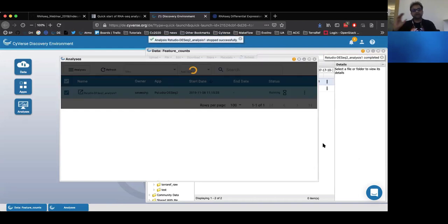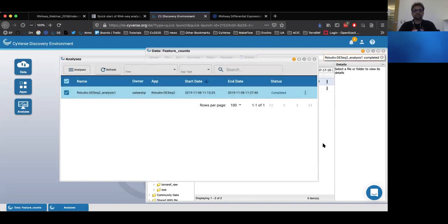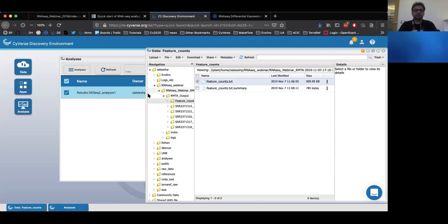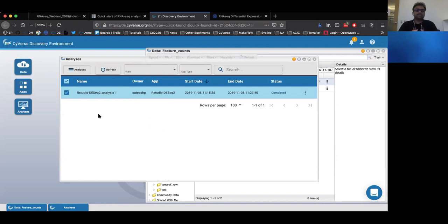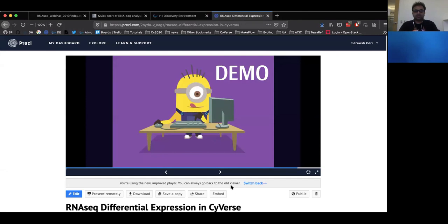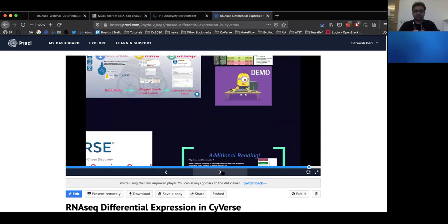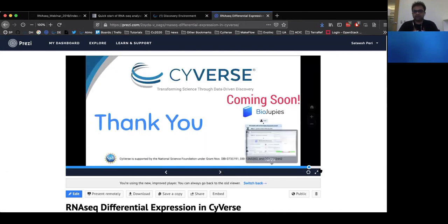When you click that button, all the information in that particular app that we have processed is saved and brought back to your data store. It should be available in your analysis window, which you can easily share with anyone on Cyverse or download and move it forward for publications. With that, I think that is the end of the webinar and I will be happy to take questions.